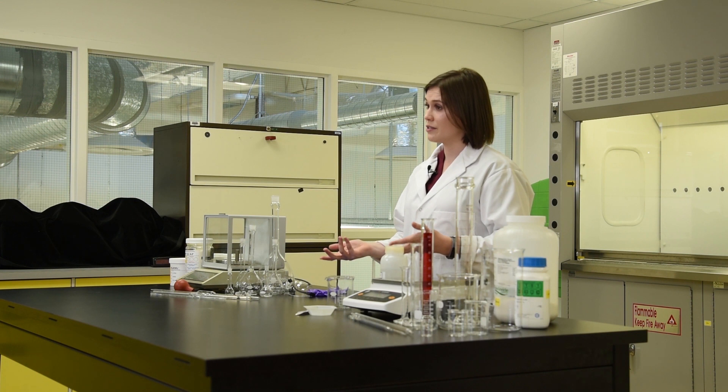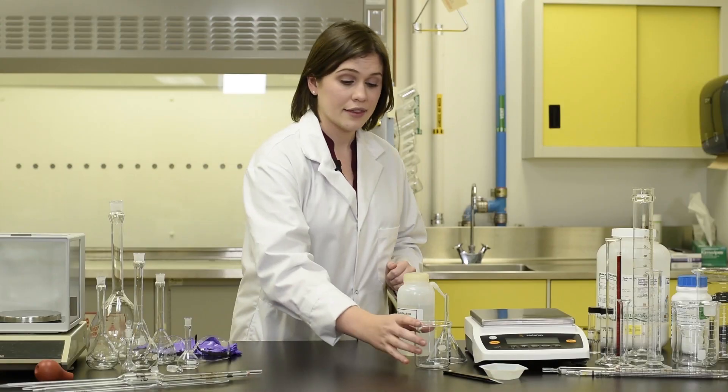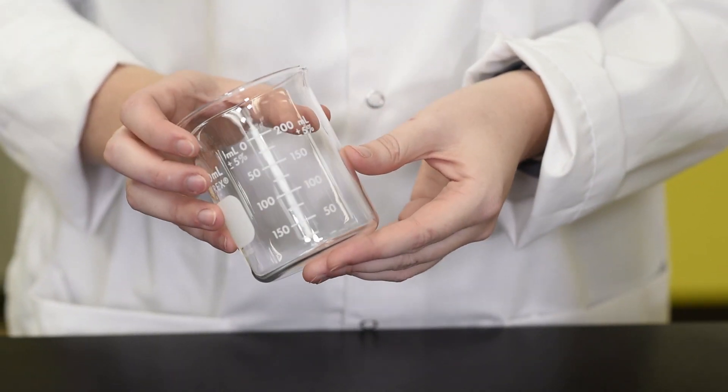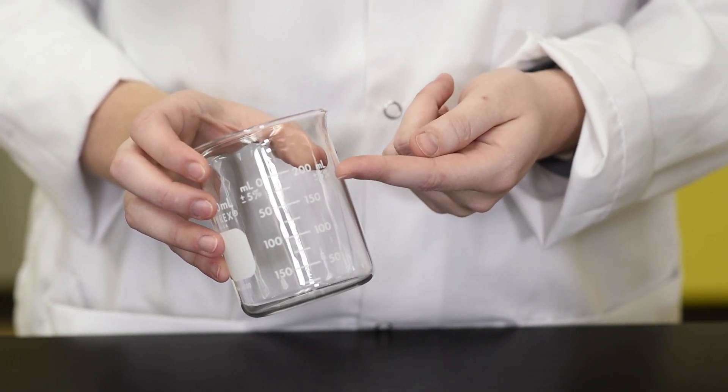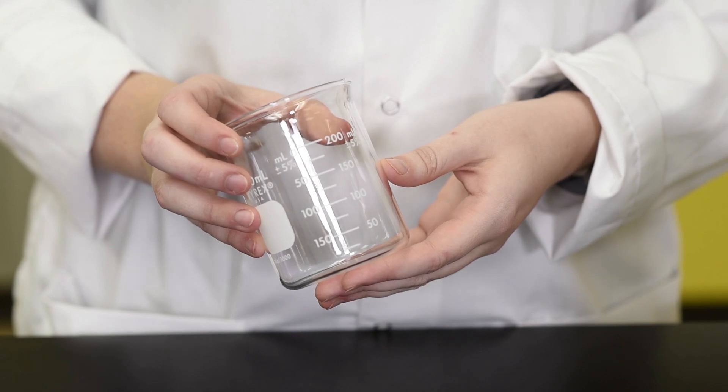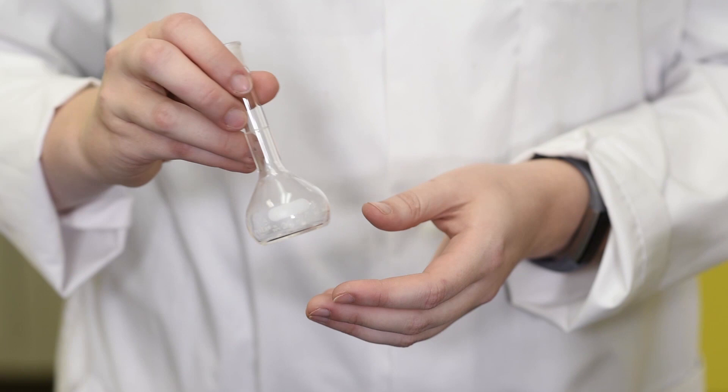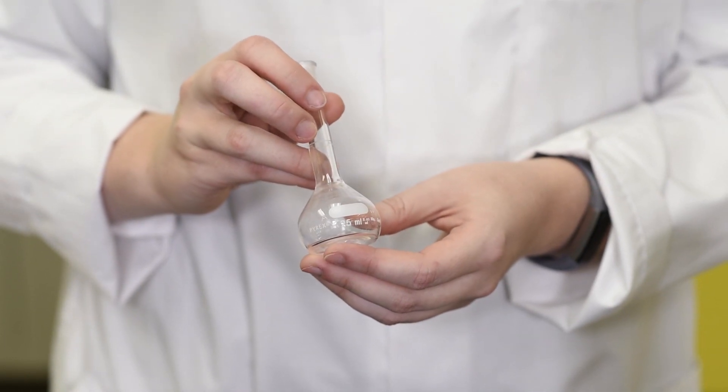Glassware will sometimes have volumetric tolerances written on the sides. This beaker, for example, measures a volume between 25 to 200 milliliters plus or minus 5% of the volume measured, meaning that if I fill the beaker to the 100 milliliter mark, the volume will actually be somewhere between 95 and 105 milliliters.